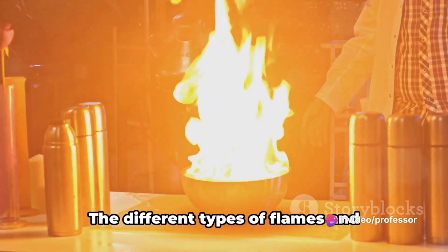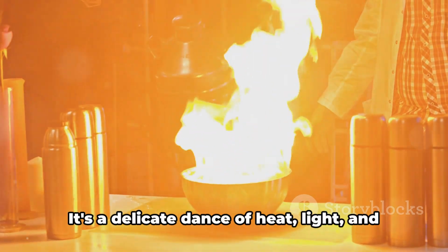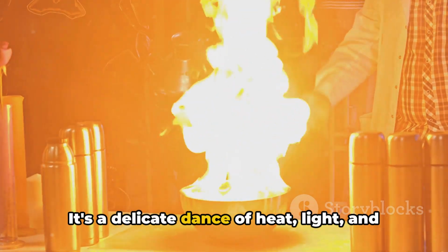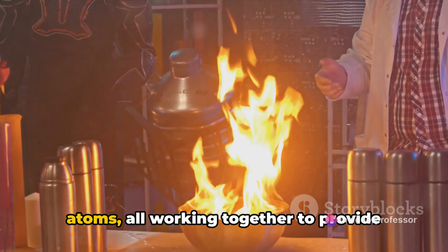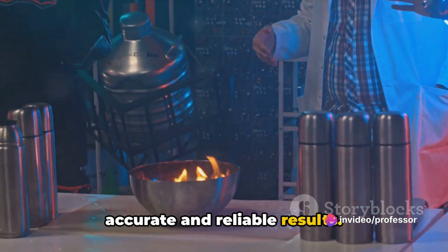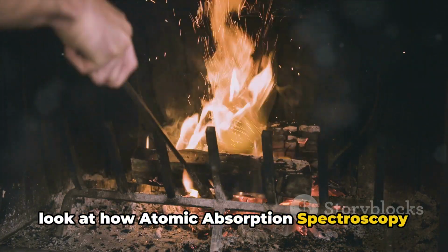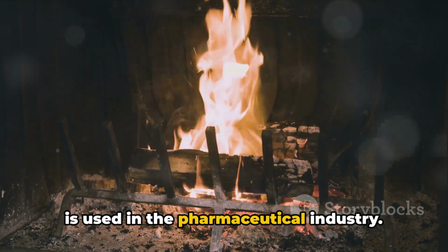So there you have it. The different types of flames and interferences in atomic absorption spectroscopy. It's a delicate dance of heat, light, and atoms, all working together to provide accurate and reliable results. Armed with this knowledge, we can now look at how atomic absorption spectroscopy is used in the pharmaceutical industry.